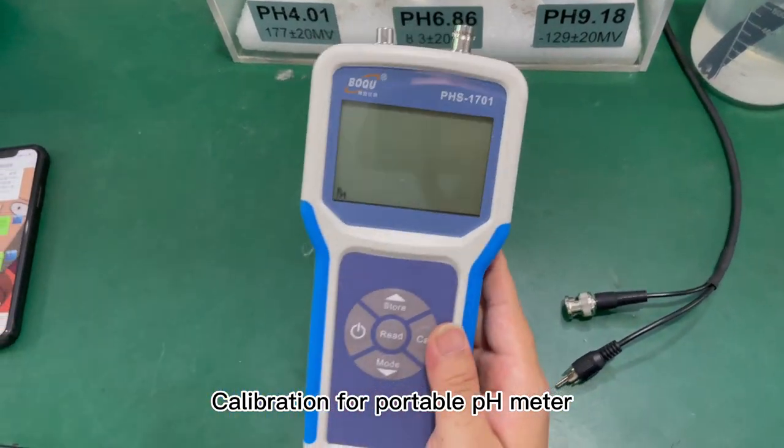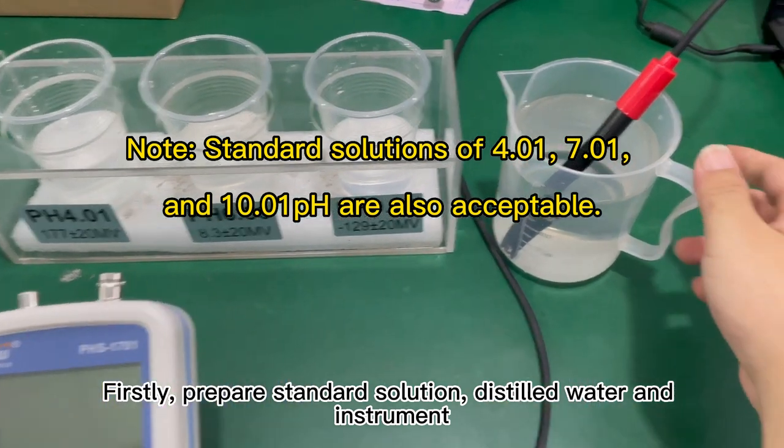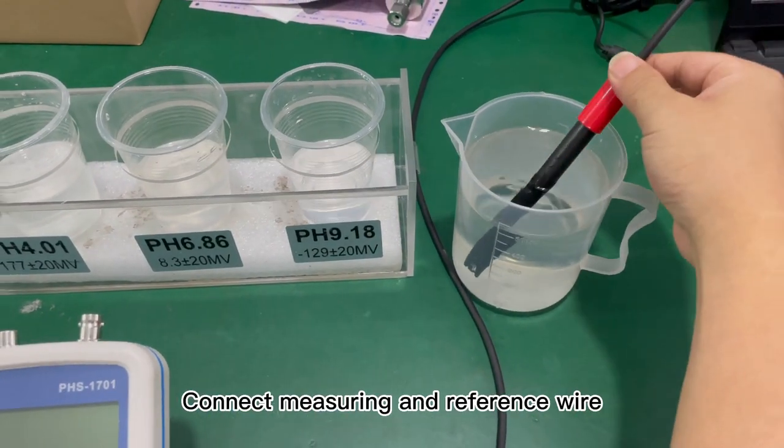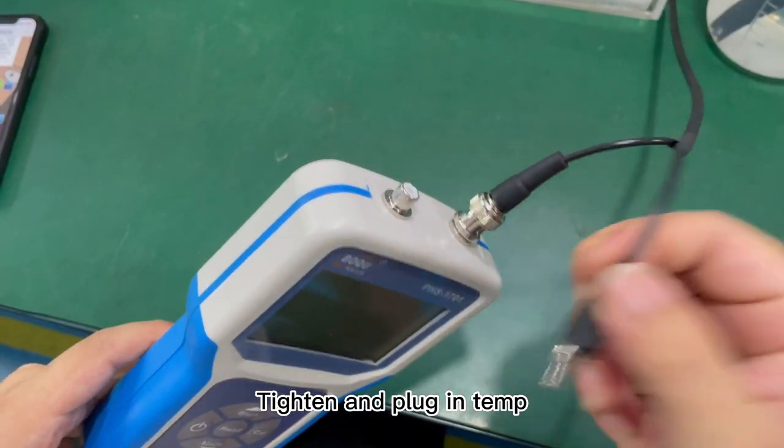Calibration for portable pH meter. First, prepare standard solution, distilled water, and instrument. Connect the measuring and reference wire. Tighten and plug in the temperature sensor.